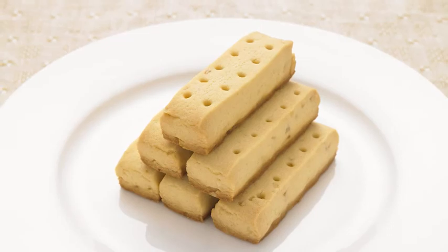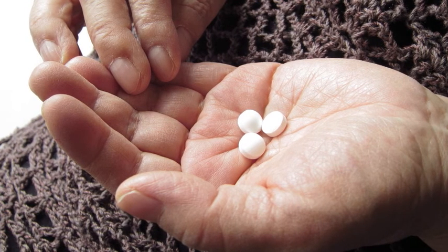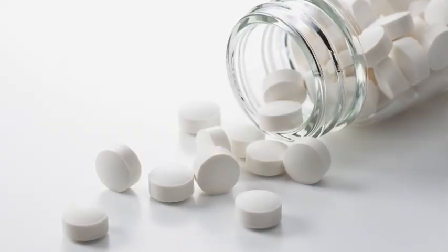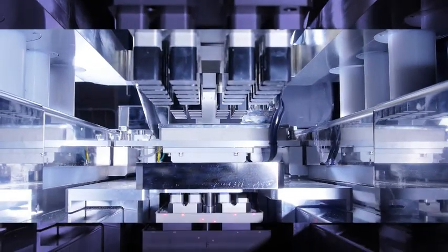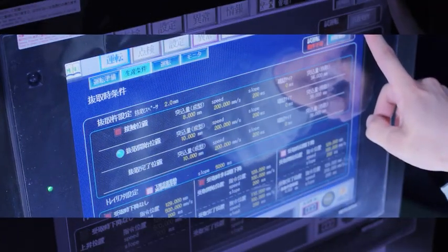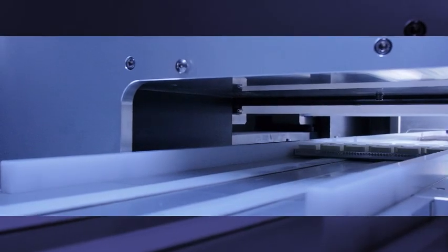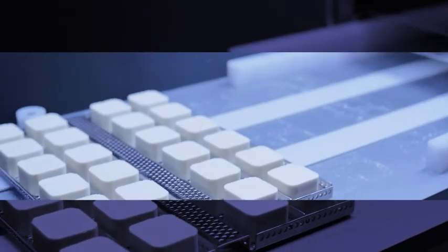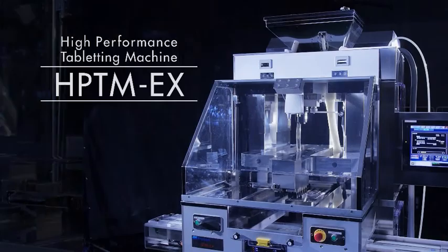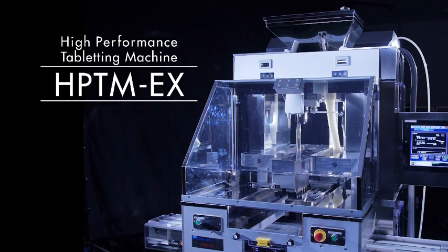Soft compression is essential to the creation of moldings for nutritional functional foods and orally disintegrating tablets designed for easy ingestion by elderly persons. The HPTM EX enables the low pressure production of revolutionary moldings that are both easy to eat and swallow. QualiCaps has applied its extensive knowledge in the manufacturing of pharmaceutical equipment to develop an unparalleled high-performance tableting machine in the form of the HPTM EX.